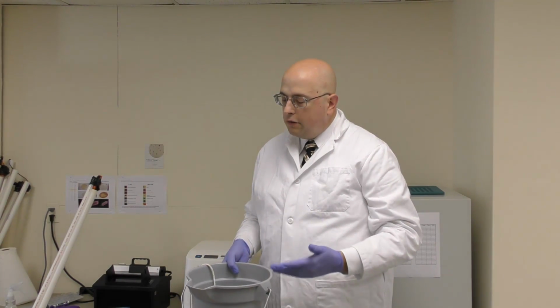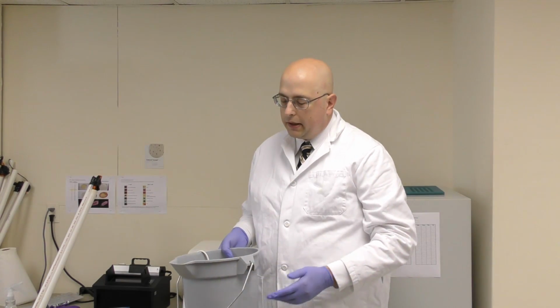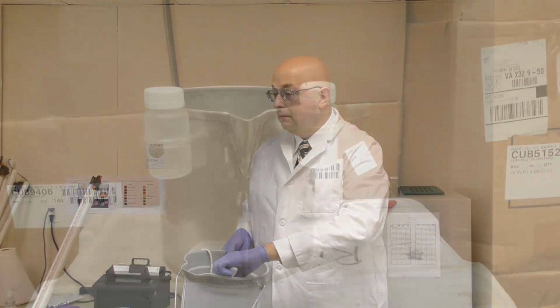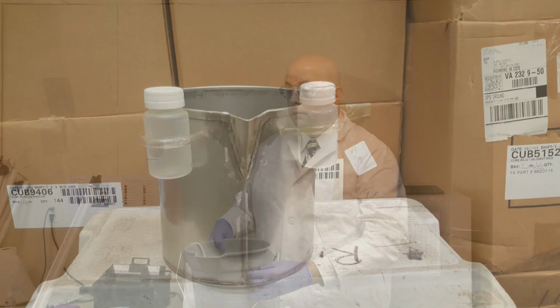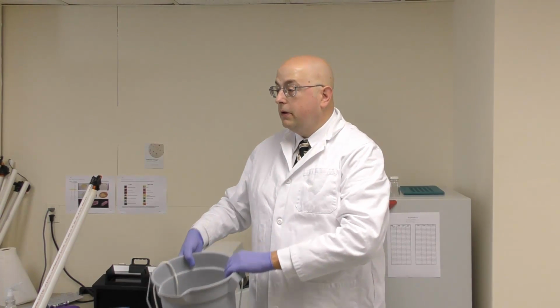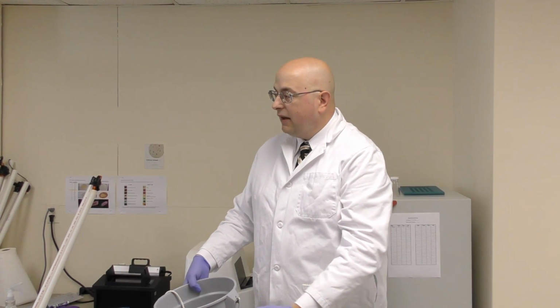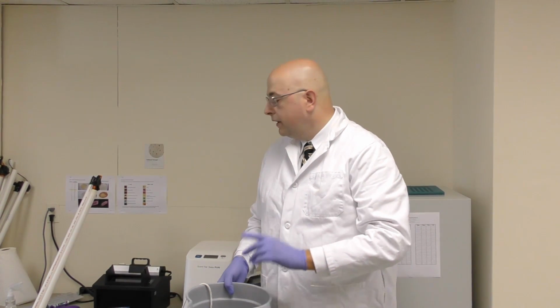In fact, our own field teams use a slightly different bucket. It's a stainless steel bucket. We drilled holes on the side of it and ran surgical tubing through those holes, so we have an outer loop of rubber surgical tubing. We put our bottle in that loop to hold it in place. When we lower it into the water and collect our sample, that bottle is still outside of the bucket, so we don't have to worry about any potential contamination from inside our bucket.